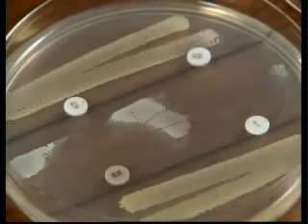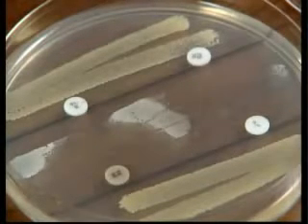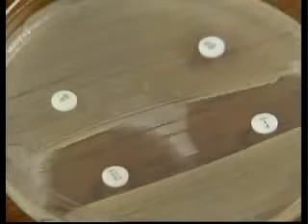It is important to spread the inocula evenly over the surface of the different sections of the plate. It is also important to inoculate the control organism before inoculating the test strain. This prevents accidental contamination of the sensitive control strain by resistant bacteria in the test strain. Take care not to inoculate the test strain over the control.